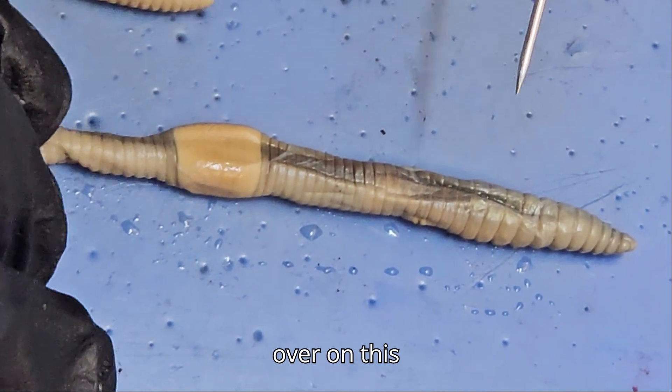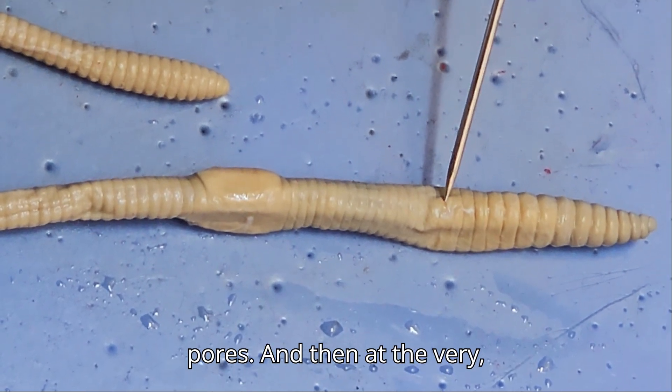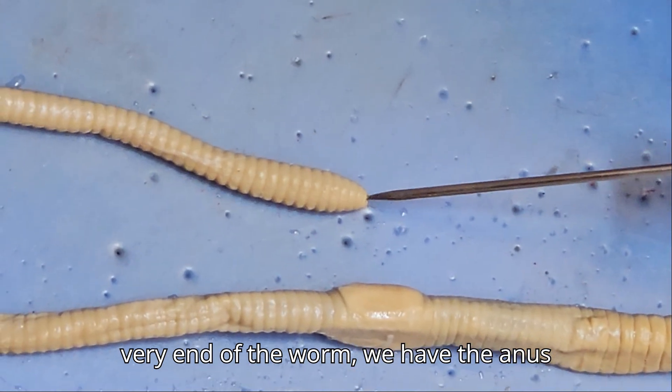If we roll them over, on this segment right here we can see male pores. And then at the very end of the worm, we have the anus.